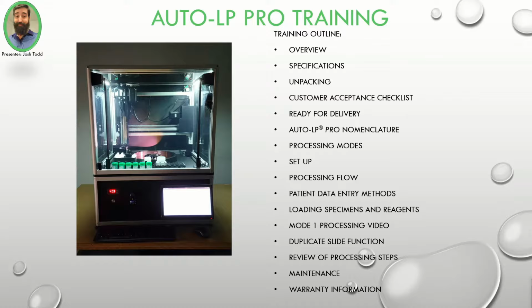Welcome to the AutoLP Pro training presentation, where I will introduce you to the cutting-edge and fully automated general cytology processor, the AutoLP Pro, the latest addition to the AutoLP product line manufactured by LGM International. The AutoLP Pro utilizes the trusted AutoLP processing technology, ensuring reliable and consistent results, while also harnessing the renowned peer-reviewed liquid prep reagents to further enhance its performance.